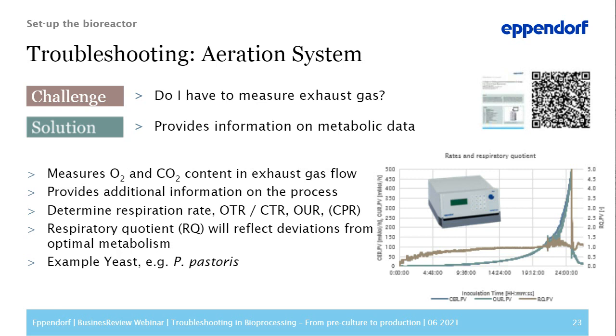Standard fermenters are equipped with instrumentation used in control loops, which means that these factors can keep the controllable conditions of the fermentation constant. So for example, flow rates of the feed and exhaust gas, or the pressure in the fermenter, pH level, DO, as well as temperature. Now, online or off-gas analysis can be an integral part of such a standardization, since it allows vital process parameters like biomass development, substrate consumption, or product formation to be monitored. This type of method also allows fast and direct intervention into critical process stages.